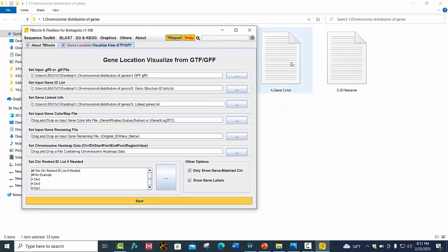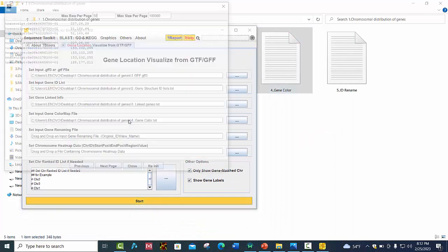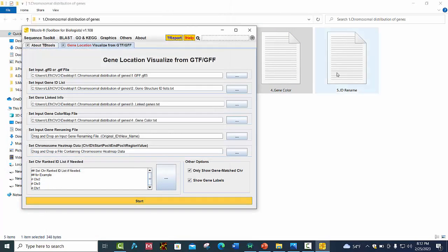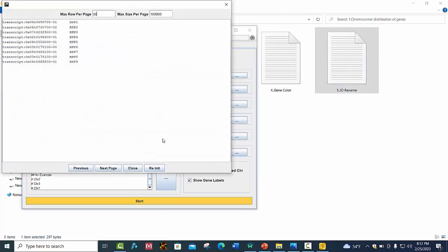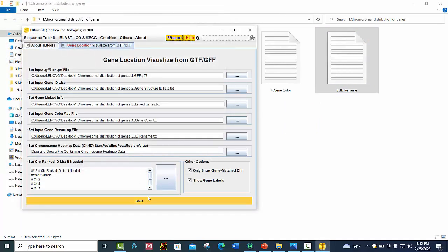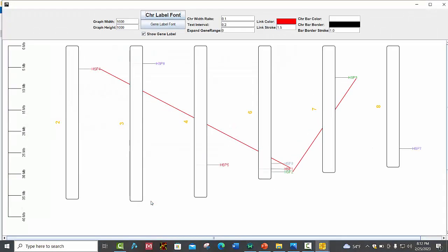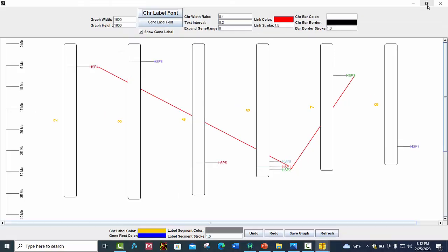The fourth file is the gene color file — place it here. Next is the ID rename file. Then press the Start button. Now you can see a beautiful illustration of our genes on chromosomes.